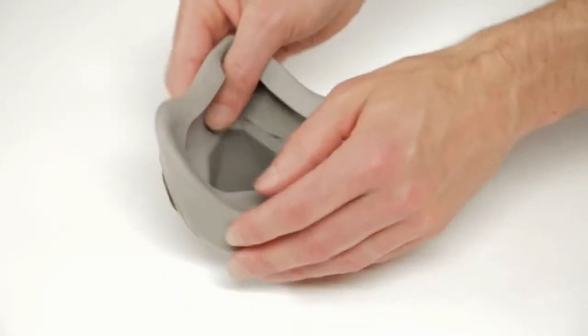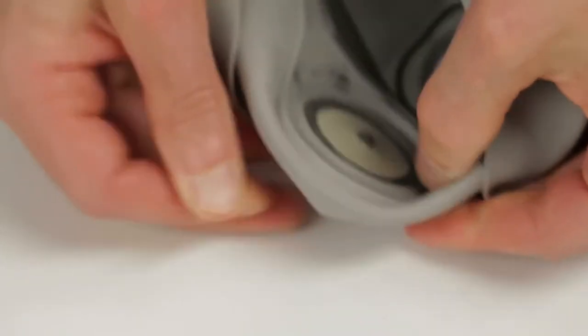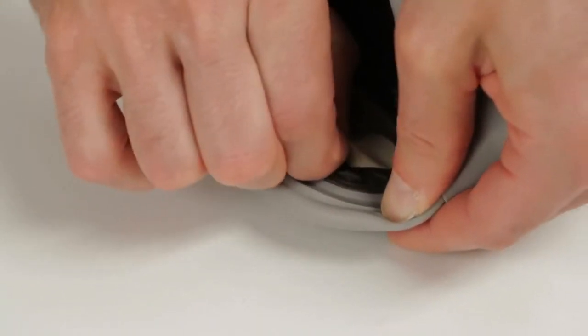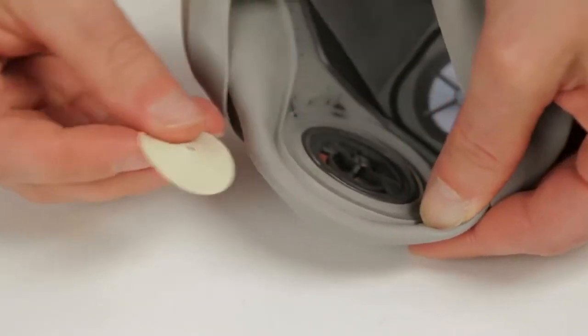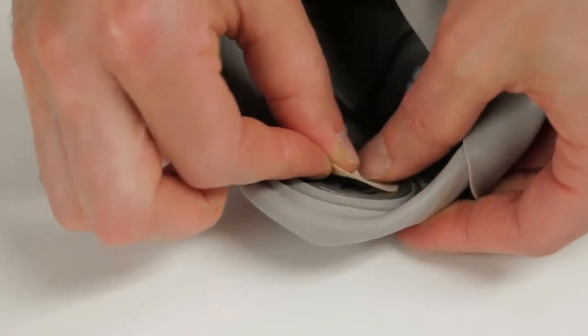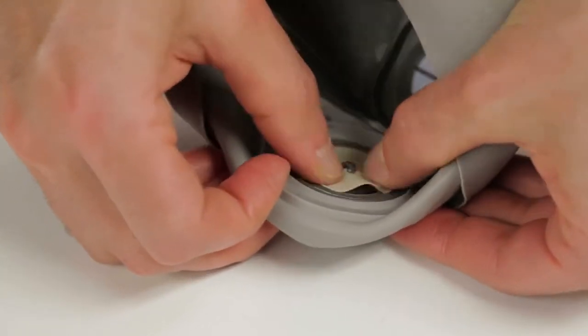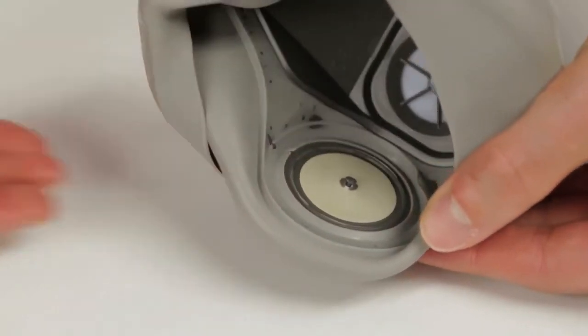To remove an existing inhalation valve, grasp the valve and pull it off the center post. To replace the inhalation valve, press the hole of the valve over the center post on the valve seat. Be certain the valve is fully engaged through the valve post and lays flat.